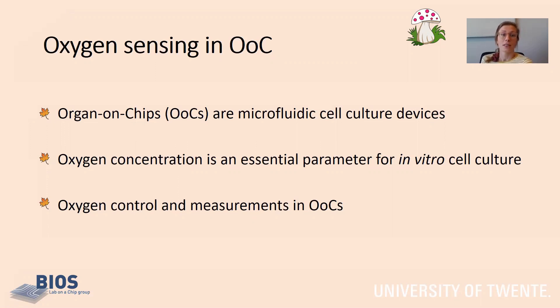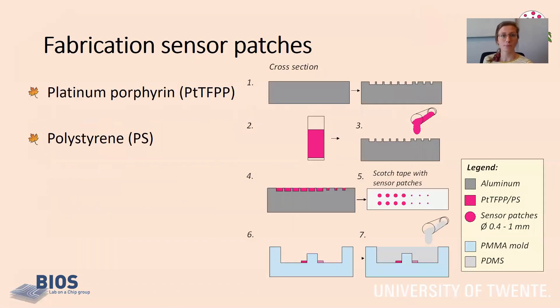Therefore, there is a lot of interest in oxygen control in organs-on-chips, and to be able to control the oxygen, we need to measure it. We fabricated oxygen sensor patches based on the platinum porphyrin, abbreviated as PTTFPP. This sensing material is embedded in a polystyrene PS matrix.